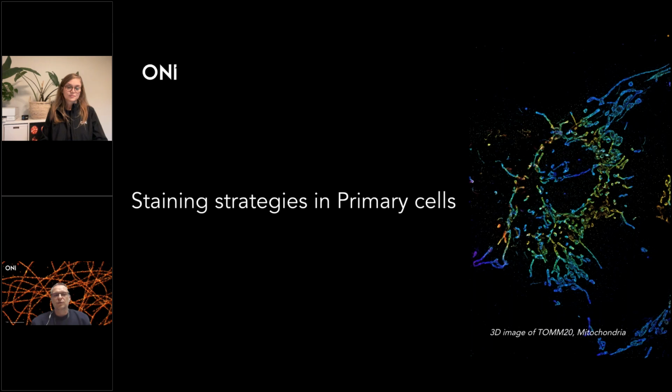If you have a lot of cells from one patient, then feel free to do the optimization on those cells. But also, as I mentioned, don't be surprised if some of the results vary between the donors, because you will really need to make multiple repetitions with different donors.